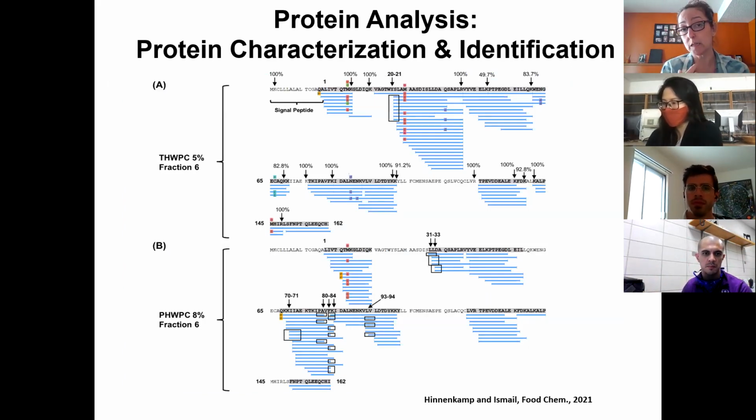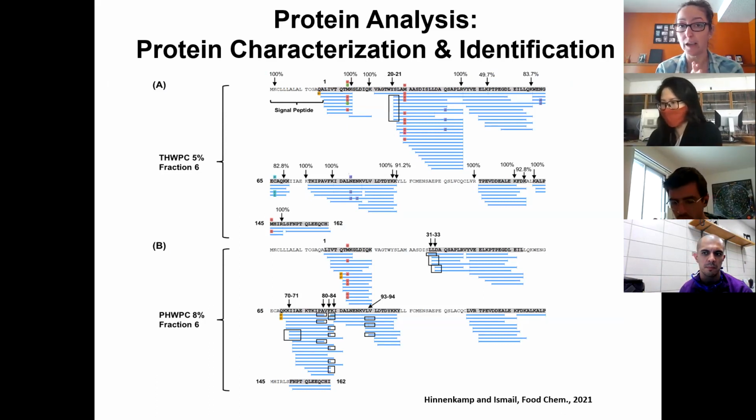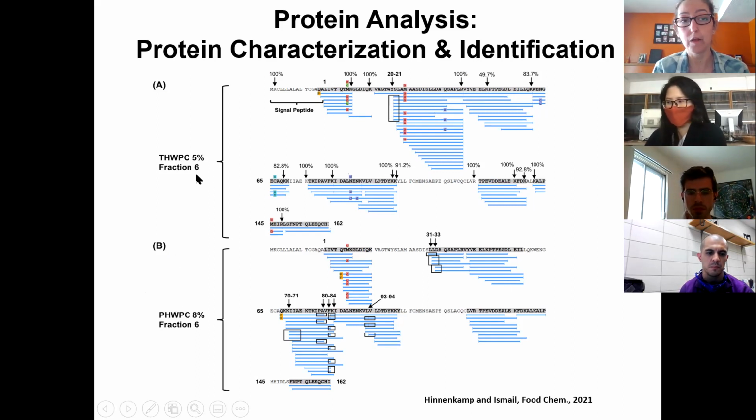This is a more recent study that we just completed, and we used LC-MS. What you're looking at is a peptide map, which is a very cool way of looking at peptides generated from certain enzymes. Here we were looking at differences in peptides generated using trypsin and a bacterial enzyme, protease M. So two different enzymes, and we looked at the hydrolysis pattern towards beta-lactoglobulin.